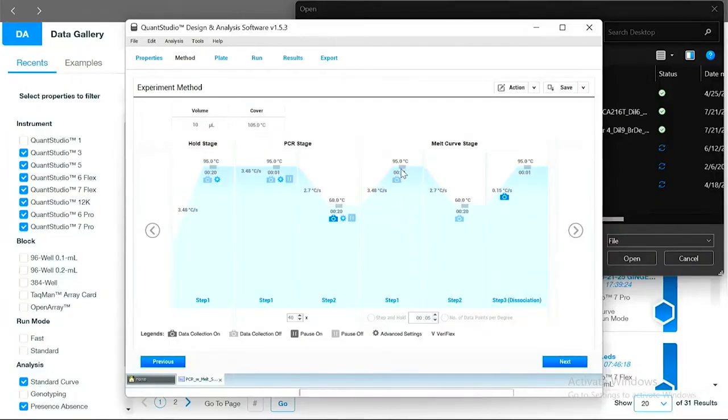But what we're going to do is we are going to finish our amplification, collect all that qPCR data, and then we're going to heat it up and we're going to cool it down. So we're going to denature everything until it's single-stranded, and we're going to make it cool. So cooler than our extension temperature, so at least equal. And then we're going to start increasing the temperature again to melt it apart slowly.